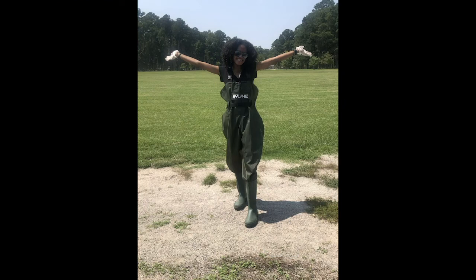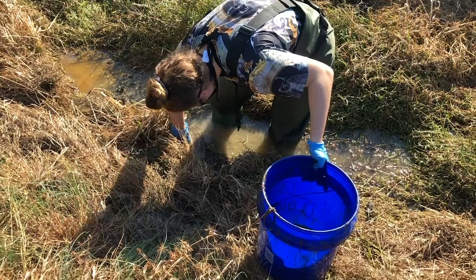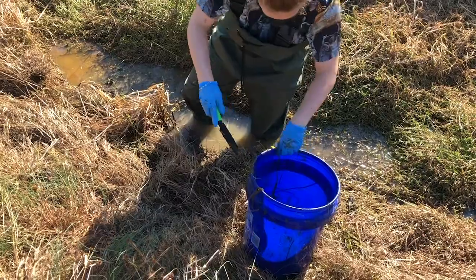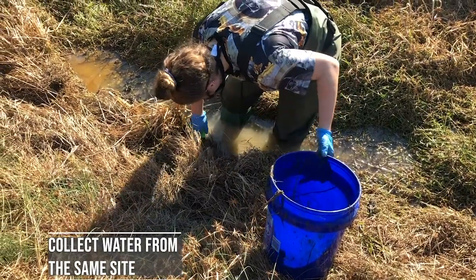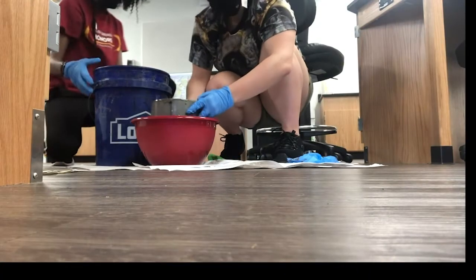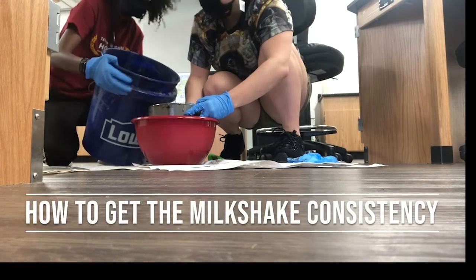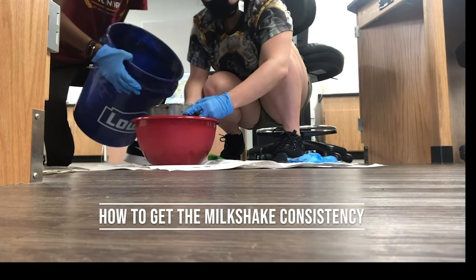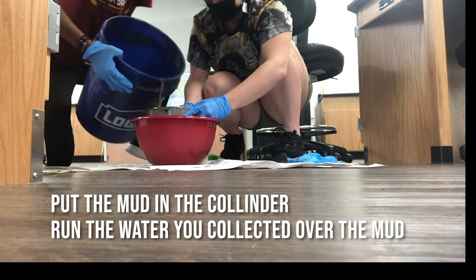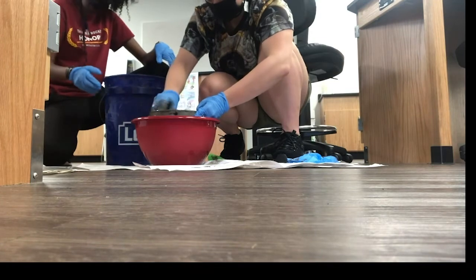Now that you know what to do, gear up, grab your shovels and your buckets, and head outside. As you're digging for mud, you should try to get as little organic matter in it as you can. This is just to reduce the amount of rinsing that you'll have to do later as we try to get this milkshake consistency. The process that we took to get our milkshake consistency was to put the mud on the inside of a colander and then run the water that you had collected over it, allowing the small sediments to pass through and the larger organic debris to stay separate.